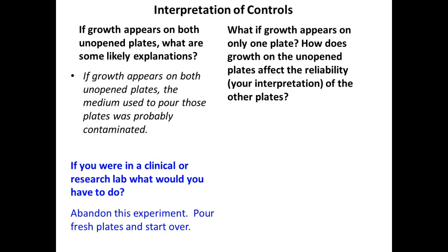No, it could be there. If we stuck those at 25, it might start growing, right? It could mean the contaminant is temperature sensitive. It could mean maybe that only a single plate got opened. Like when I was over there, right, I noticed one of them was open. I put it off to the side. We don't want to use that plate. It's potentially been contaminated.